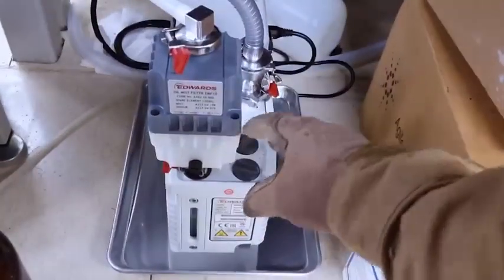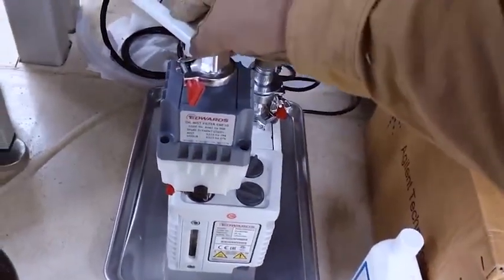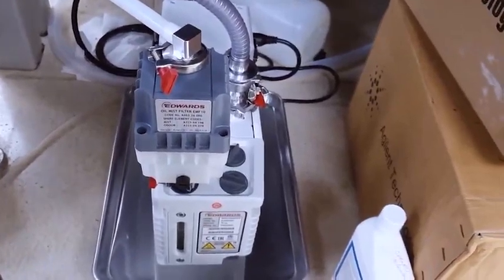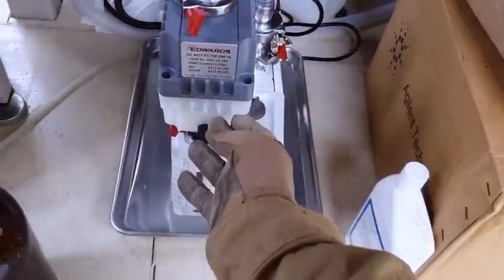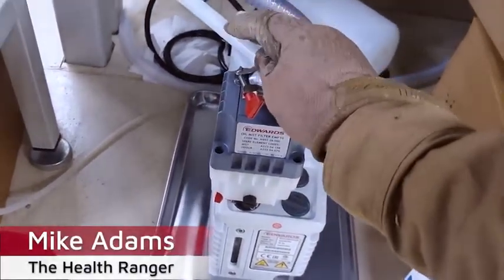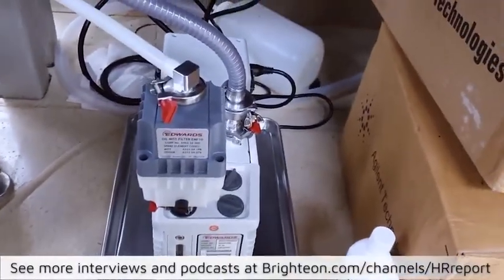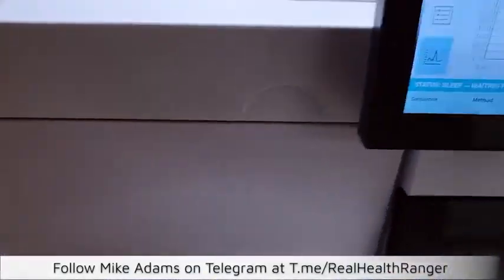It's surprisingly small — these things have become a lot more efficient over time. This is the rough pump; the vacuum is pulled through here. You need a vacuum in order to have a high signal-to-noise ratio on any mass spec instrument — if you don't have a vacuum you're just looking at noise all day. I think this is the primary oil capture system — this vents out everything that this rough pump pulls out of the inside of the instrument, which can include your vaporized sample. That's why we have to have exhaust hoses here. Stay tuned — it's going to get fun.